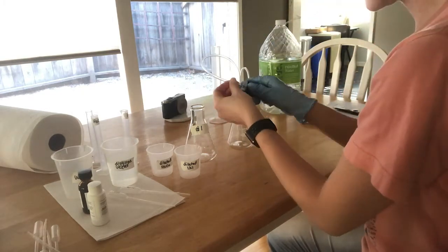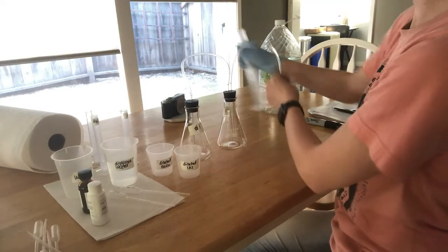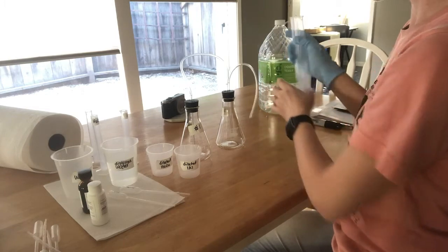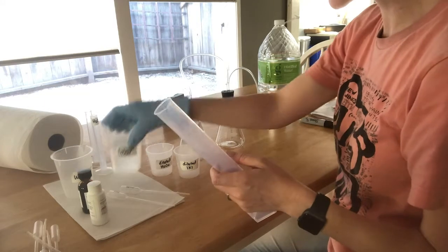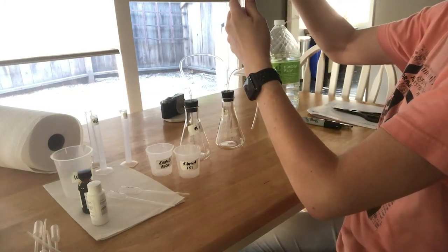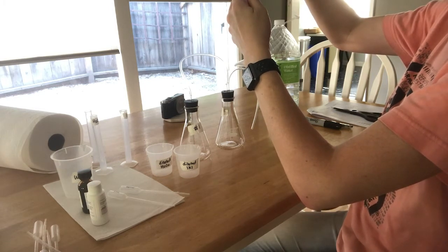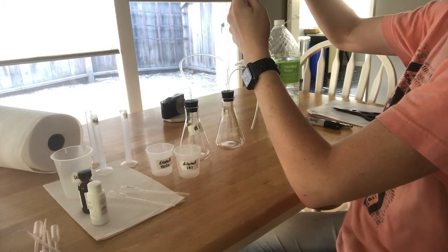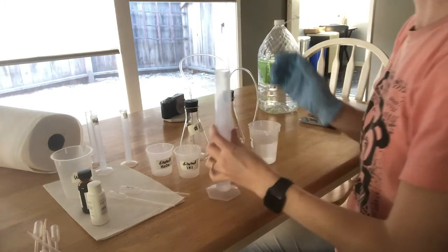In general, just be really careful when you're handling these stoppers with the glass tubing. You should have a 100mL graduated cylinder that you're going to put some water in. The instructions say 10 milliliters, but it really doesn't matter because you're going to start your timer at whatever volume you're reading. So just something close to 10 — it doesn't have to be exact.